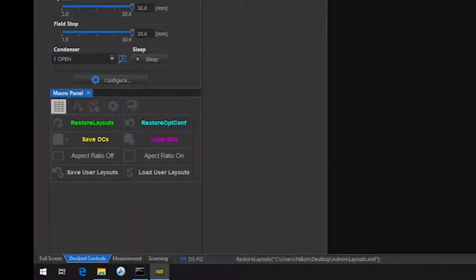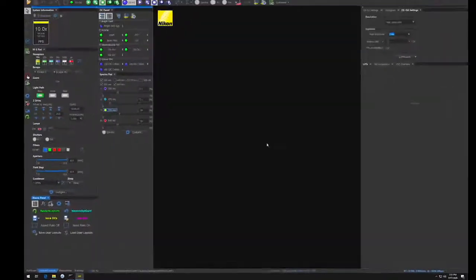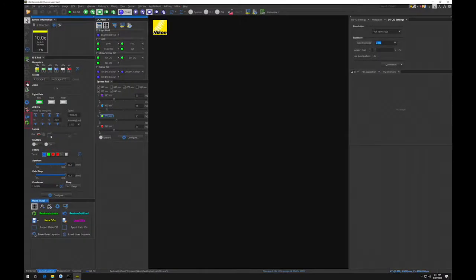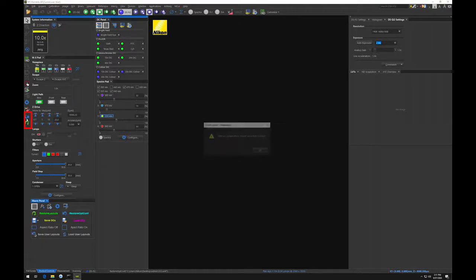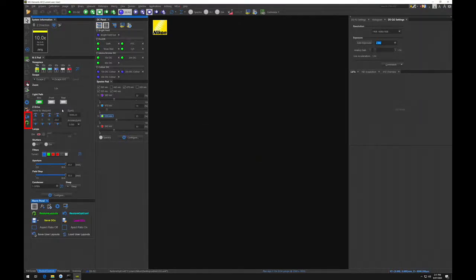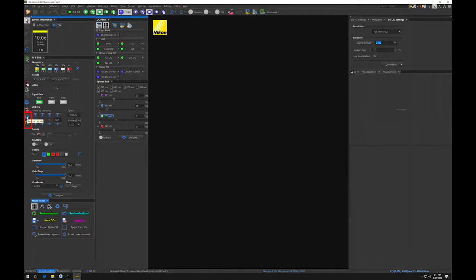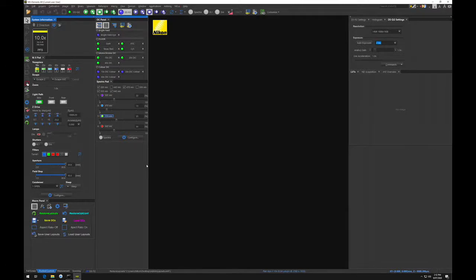If the macro panel is missing, you can load the default OCs and default layout from the button in the left-hand side toolbar. If you have your own saved OCs or a saved layout, please use the macro button to load user OCs and load user layout.